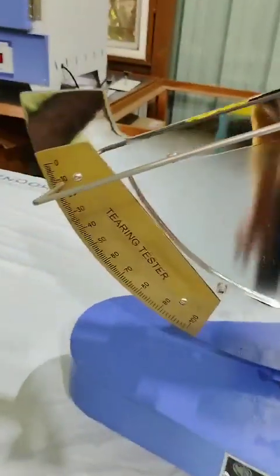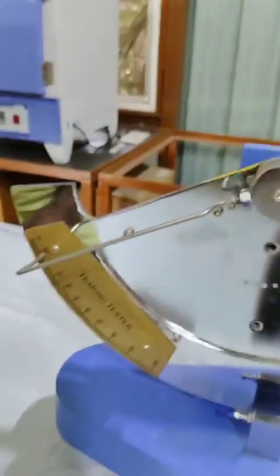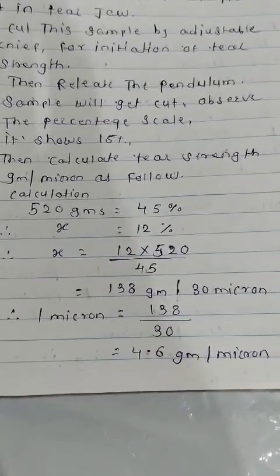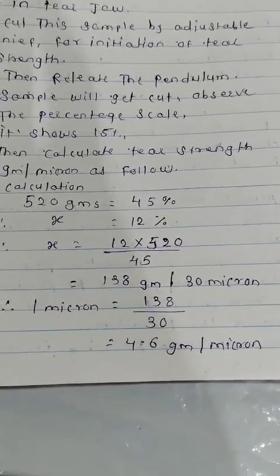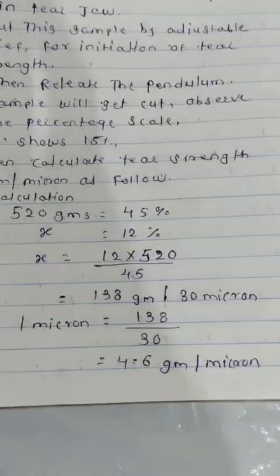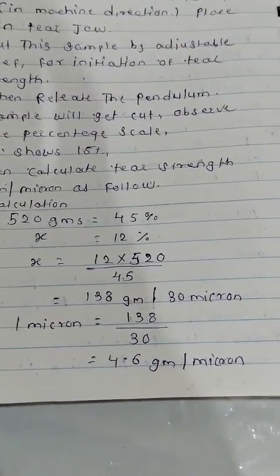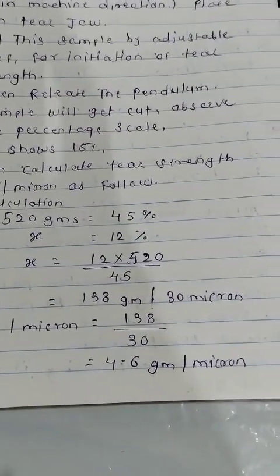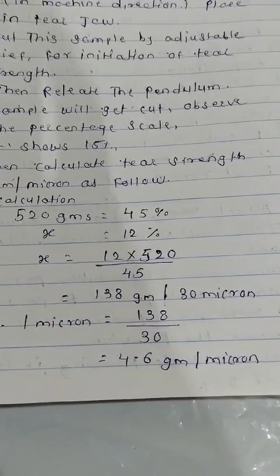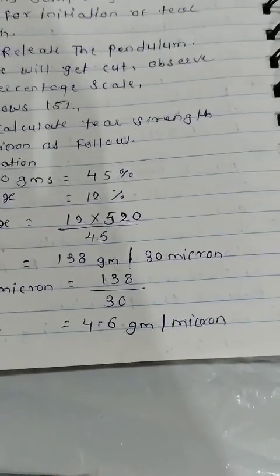Now the reading is at near about 12 percent. Let's see the calculation of tear strength. For 520 grams, our reading was 45 percent, and for our film the reading was 12 percent. To calculate the grams for the film, we take grams as x. So, x equals 12 into 520 divided by 45, which equals 138 grams for 30 micron, because the film was 30 microns. To calculate for a single micron: 1 micron equals 138 divided by 30, that is 4.6 grams per micron.